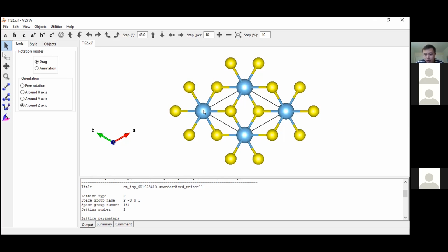And it will also show you where the 3 bar axis stands. This, of course, is on the main axis. All those symmetry elements will be shown in Mercury. And you can explore how those atoms are related by symmetry. In fact, the connectivity of those polyhedra, as I mentioned in the previous lecture, is very important for their conductivity. And you can also explore how they are related by this kind of symmetry. For example, sometimes you have a glide plane, and it's very likely that different octahedra are interconnected by some kind of symmetry operation.